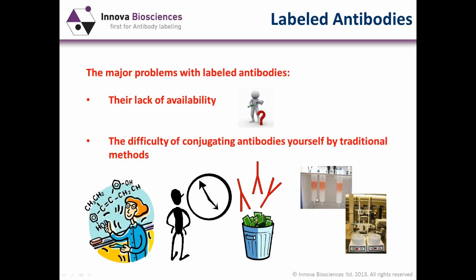Also through the separation steps, you have a lot of wastage because there will be some wastage of material. You may only recover somewhere between 50 to 70% of your material. Therefore, you're going to end up losing money in that respect as well.